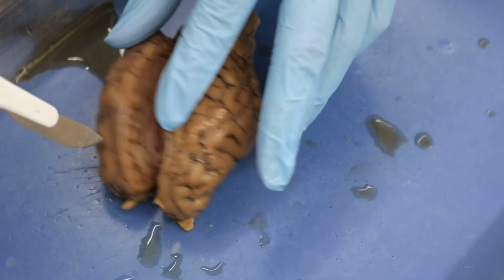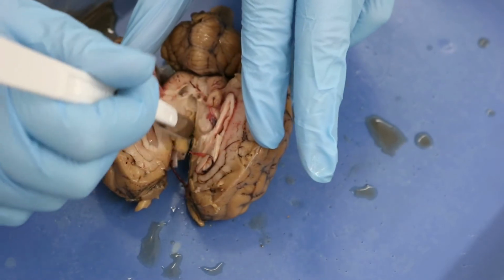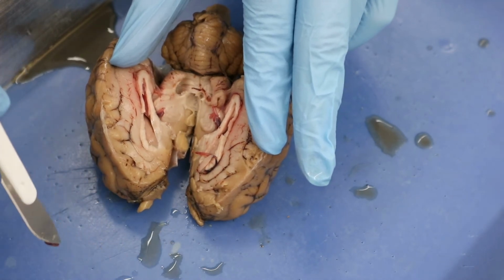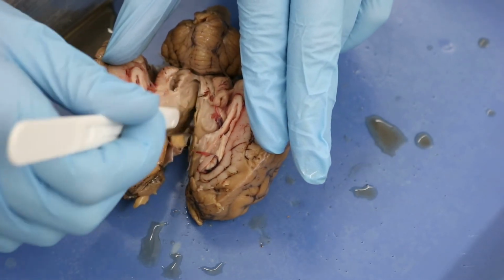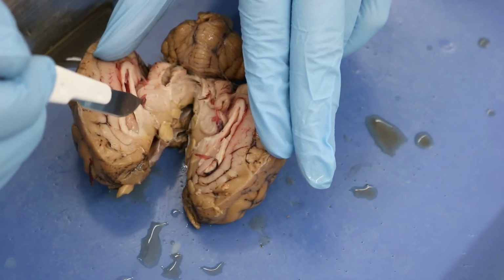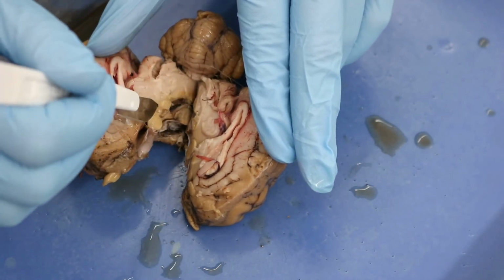And believe me guys, I have done surgery on human beings and I have dissected human cadavers as well. I'm not telling you to do small and slow and cut away from yourselves because you're amateurs. I'm saying because this is the correct way to do it. All right, don't think like, oh, I've done this before, I know what I'm doing. I do too, believe me, okay? But this is how it's supposed to be done, okay?